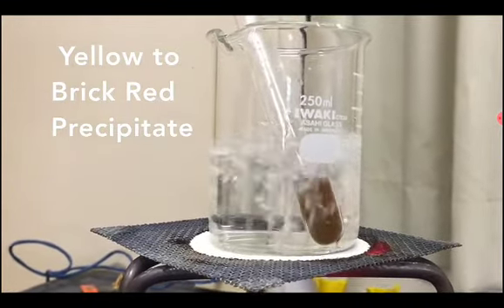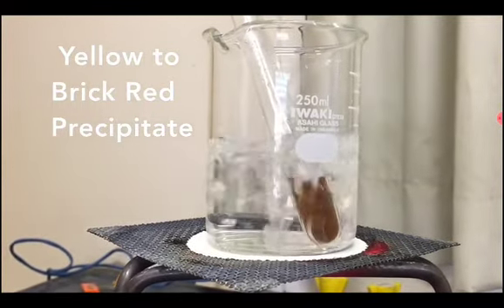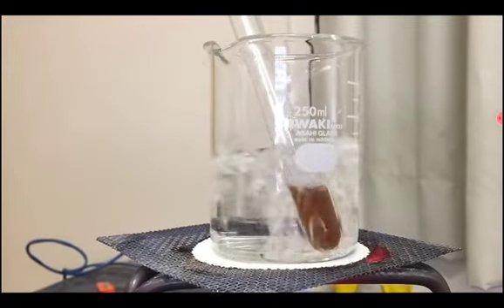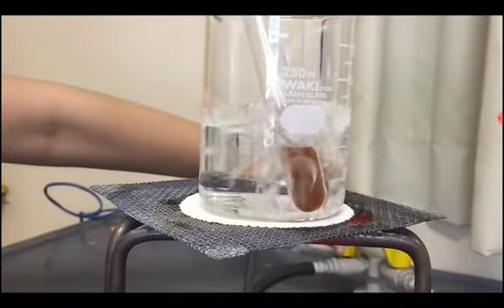You can see the color changes that are taking place. If the final color change is brick red, what does it mean? Once it turns into a brick red precipitate, we will turn off the Bunsen burner.